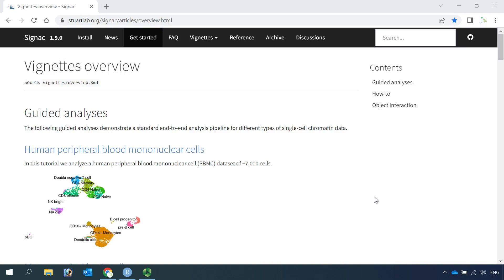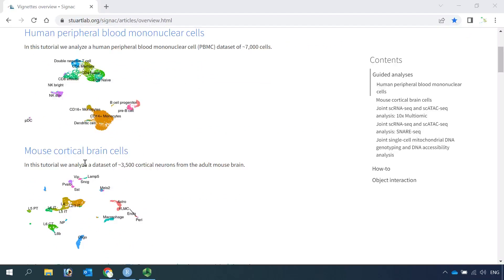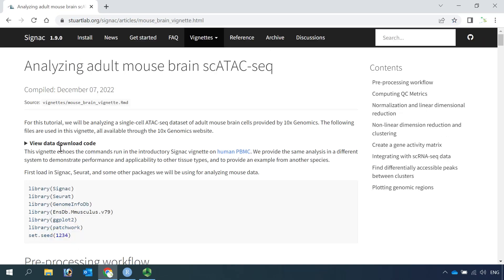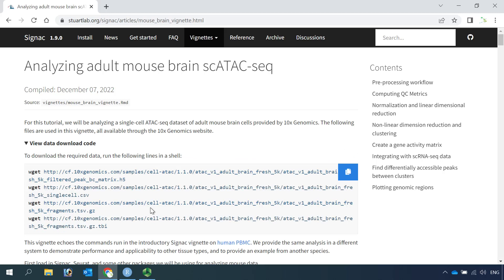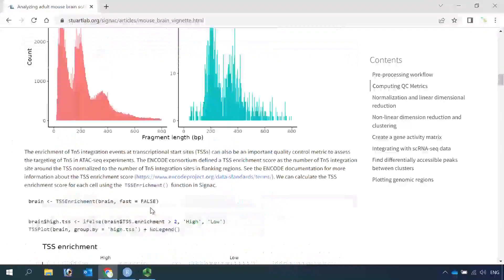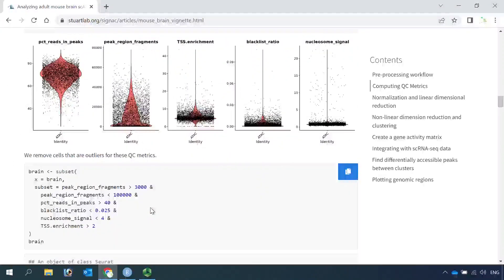For today's demonstration, I will use the adult mouse brain dataset. You can see from the SIGNAC online tutorial, there are two datasets for online demonstration: the PBMC dataset and the mouse brain dataset. I analyzed the mouse brain dataset already. If you want to practice with the mouse brain dataset for DNA sequence motif analysis, you can click the link and download the data from here, and also you can save all the code for the online tutorials. So you can follow the online tutorial to create the mouse brain Seurat object.